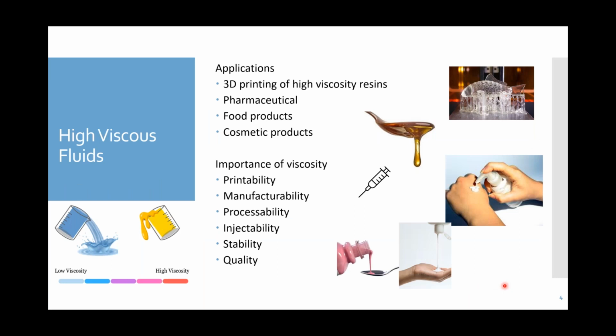People often use the expression thin or water-like for liquids that have low viscosity, and thick for liquids with high viscosity. Generally speaking, fluids with larger, more complex molecules will have higher viscosities. In polymeric fluids, the polymer chains can also become entangled with one another, forming networks that are able to trap water. So depending on the level of the entanglement, viscosity may increase. Viscosity is also dependent on concentration, and the relationship is not usually linear. For example, a small increase in concentration of a protein may increase viscosity a little, but once a critical concentration is exceeded, the viscosity can increase exponentially.